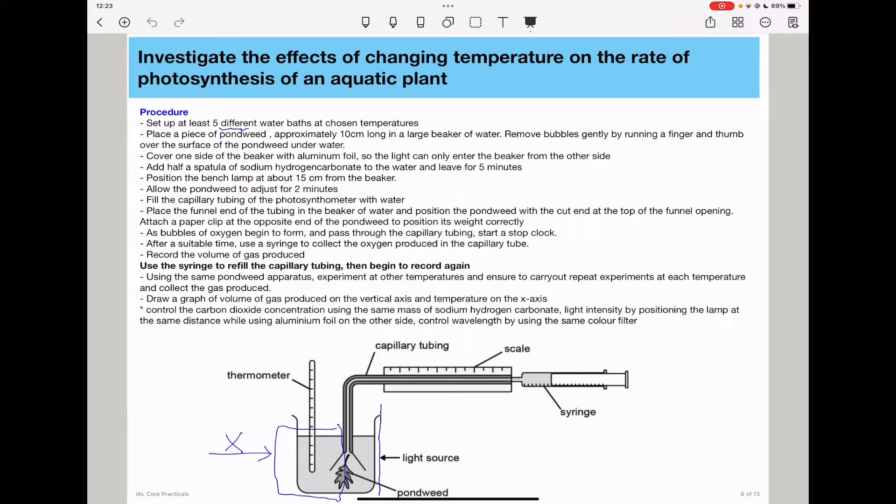If it's positioned at a specific distance, the plant is exposed to the same constant amount of light in every experiment. Allow the pondweed to adjust for two minutes. This allows it to get used to the new conditions in which it has been placed.